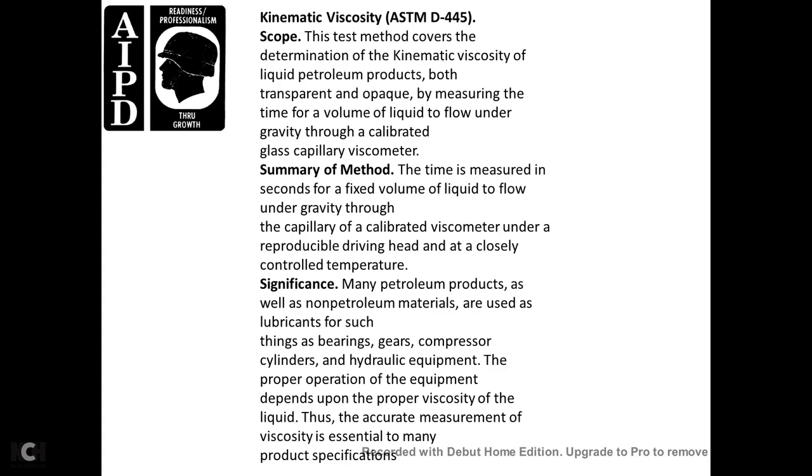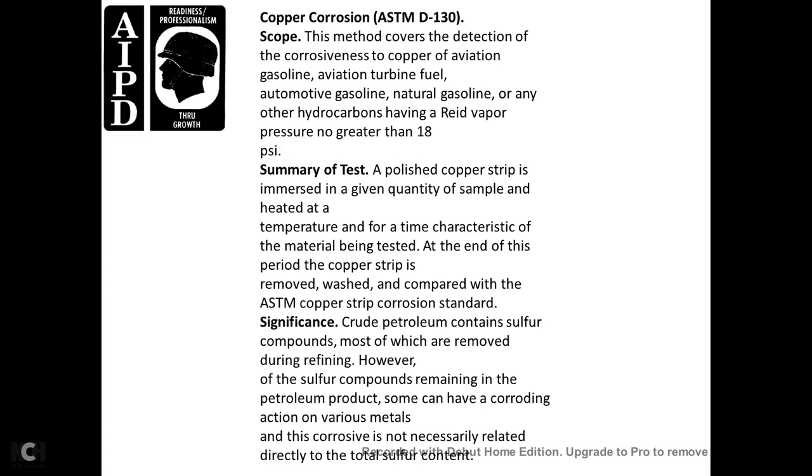Significance: many petroleum products and non-petroleum materials are used as lubricants for the bearings and gears and compressor cylinders. Hydraulic equipment and other operating equipment depend on the proper viscosity of the liquid. Thus, accurate measurement of viscosity is essential to many product specifications.